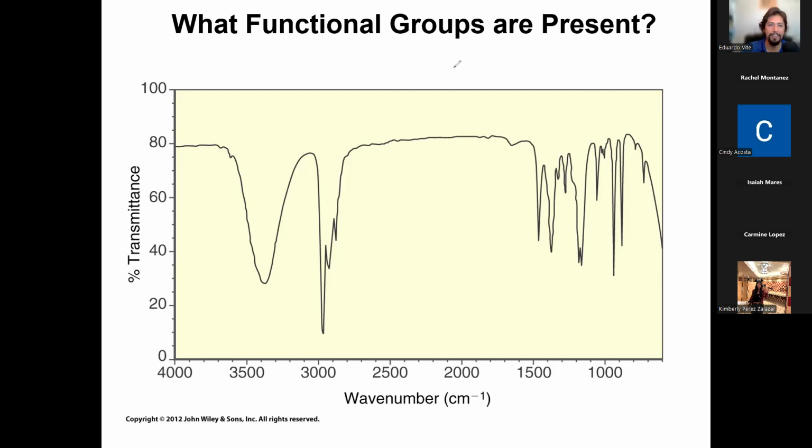So you say the beginning. Can you give me a number? Can you tell me what wave number you mean? All right, from around 3,500. Yep, pretty good. You can give me a range. You can say between 3200 and 3500, between 3300 and 3500. It doesn't have to be exact, as long as I can pinpoint the region, right? Just around the block, some people would say when giving directions. Like, yeah, between 3,500-ish, a little bit less.